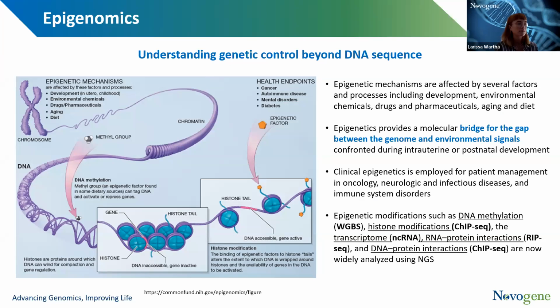We are always working on improving our protocols, of course, and like I said, if you're doing PacBio, for example, you can look at methylation and at the DNA sequence at the same time.